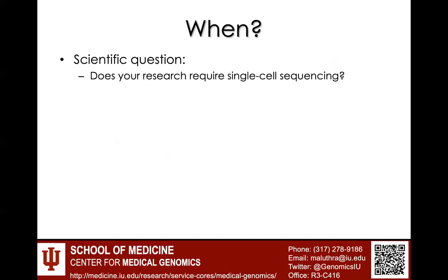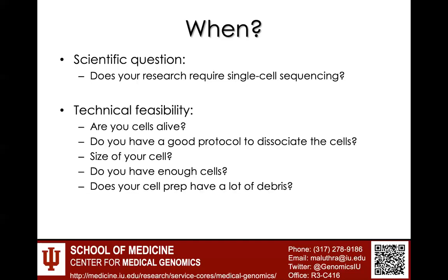To decide whether you need to do single-cell analysis, the first thing you need to consider is, does your research require single-cell sequencing? In short, is the heterogeneity of the different cells important to your study? If it is, single cell is probably a good option for you.